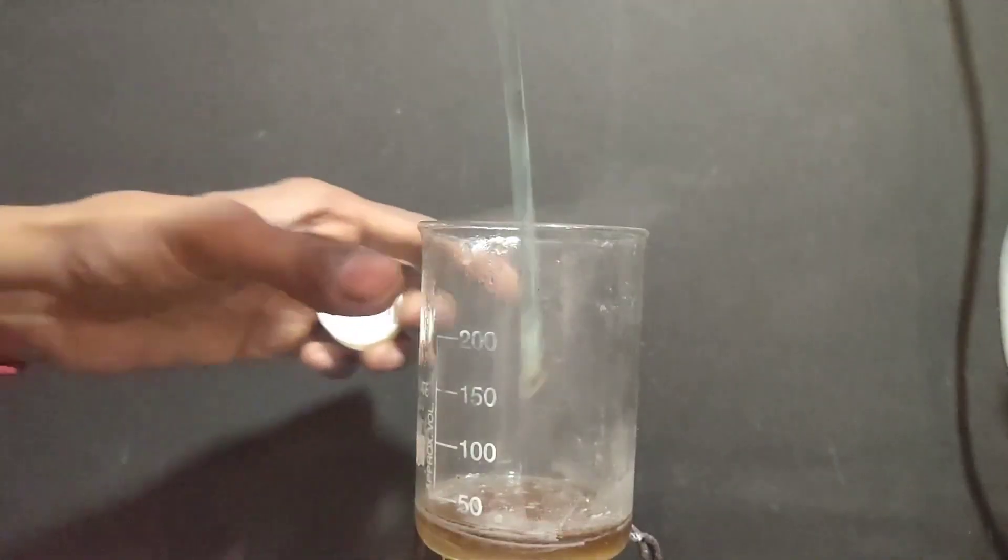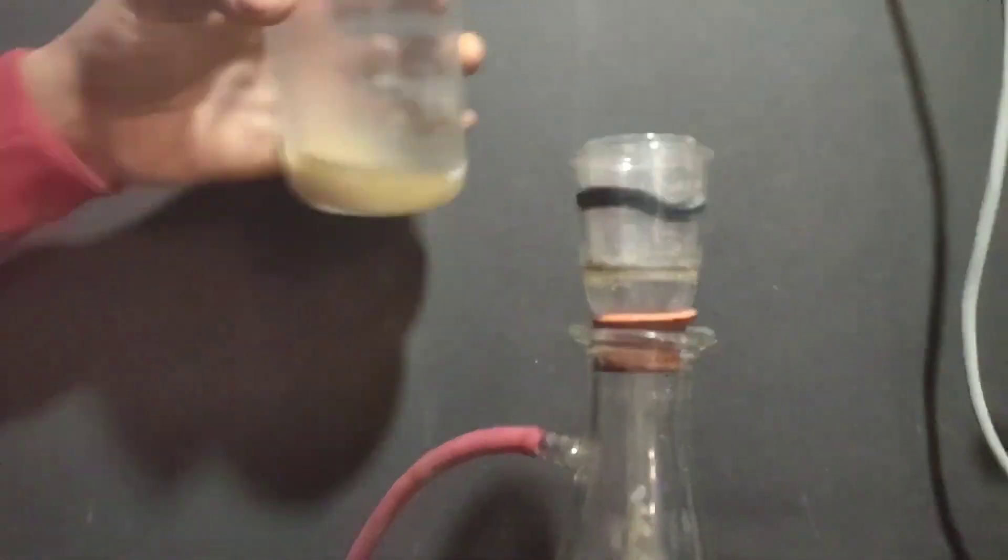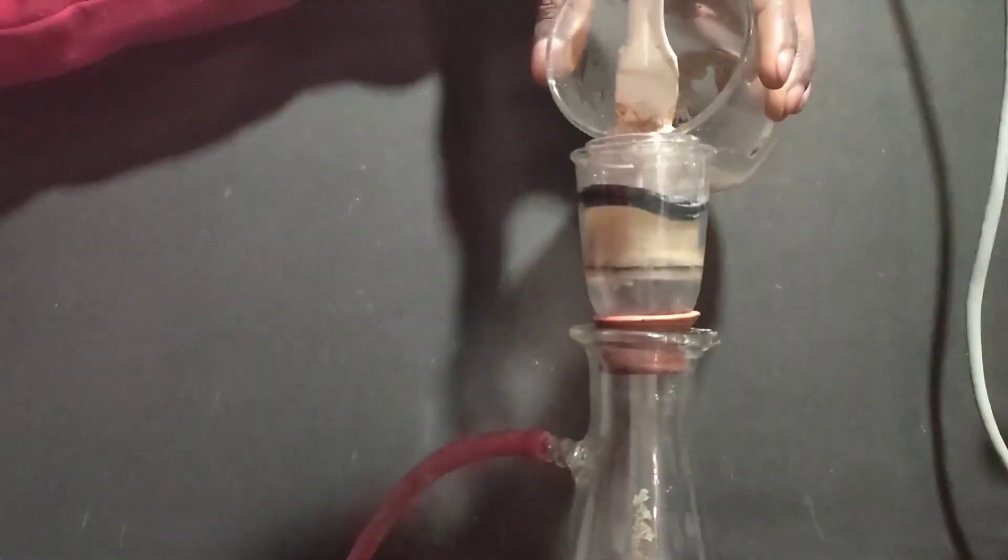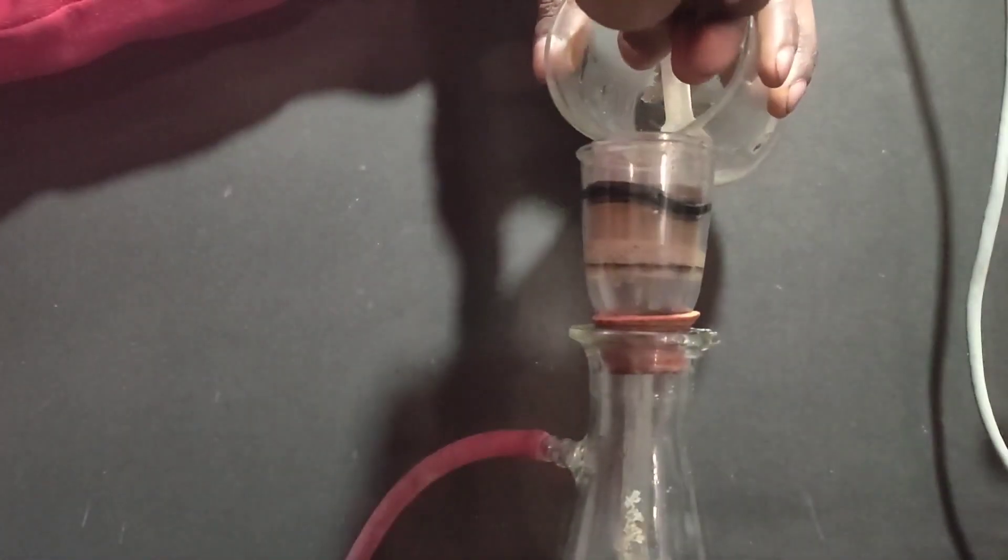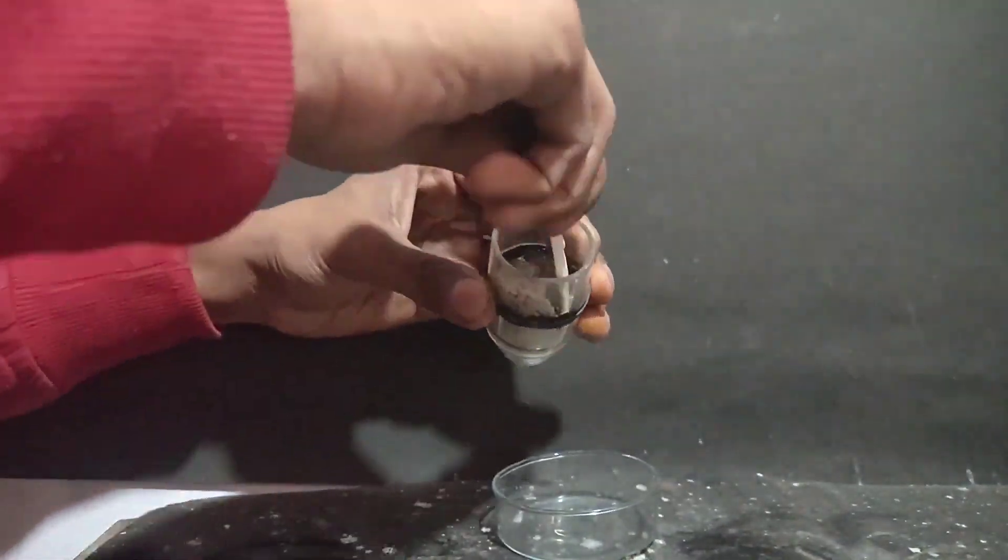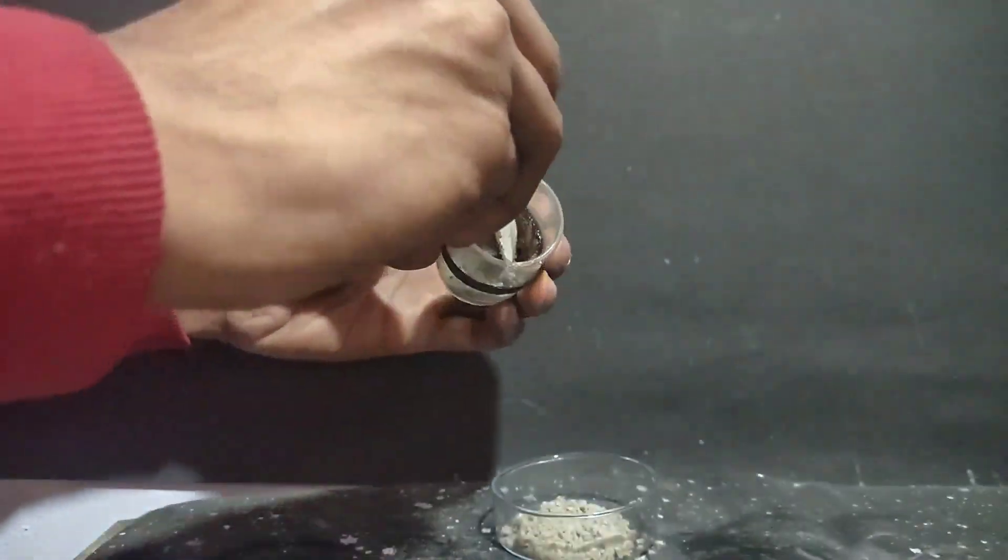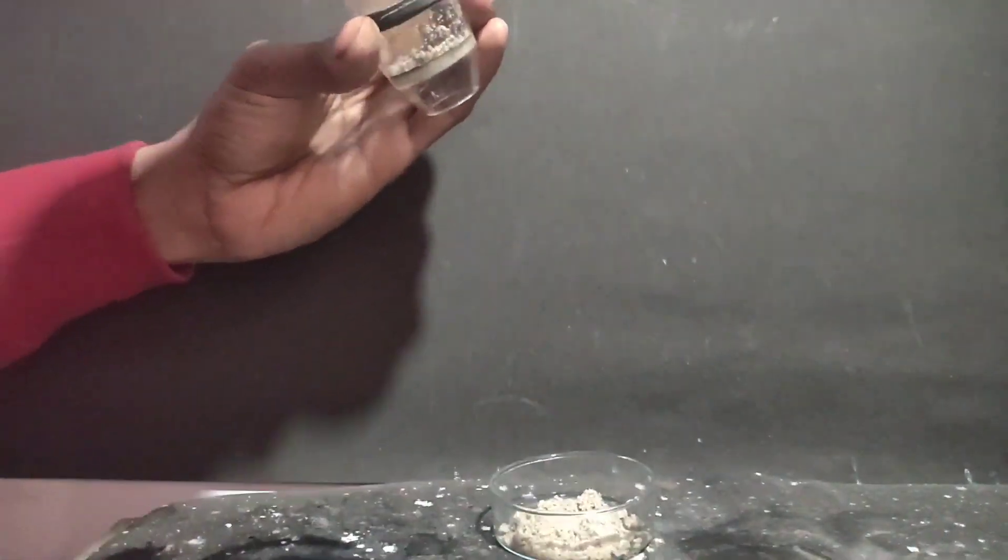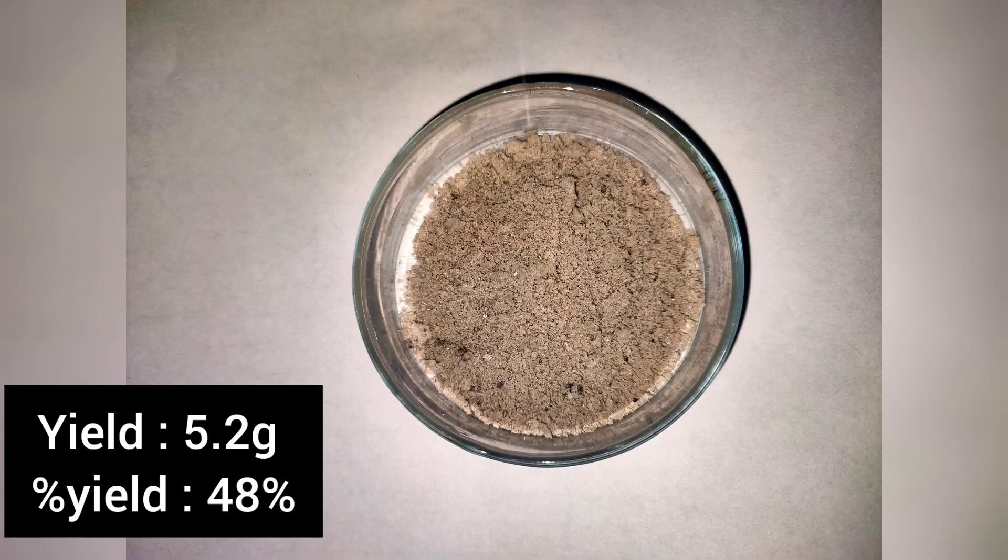When the solution was concentrated and cooled, the potassium iodate formed was filtered off using vacuum filtration on a sintered glass crucible. All the crystals were taken out using a plastic spatula in a small petri dish. The crystals were off-white due to some impurities. The yield was 5.2 grams which corresponds to a percentage yield of 48%.